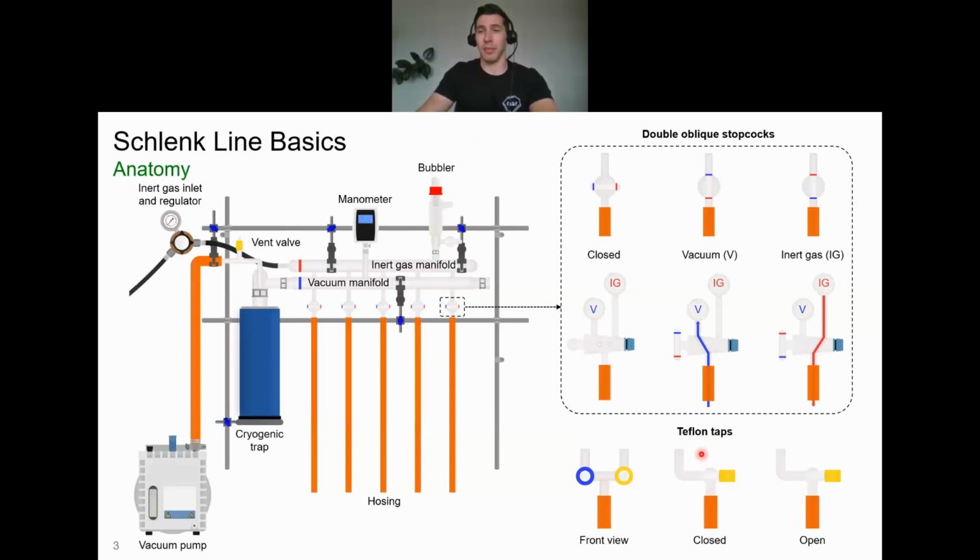And these simply screw open and screw closed. And when they're closed, the Teflon is partially malleable. It will form a perfect seal with the glass. And when it's open, of course, the air or the inert gas can flow right into your system.